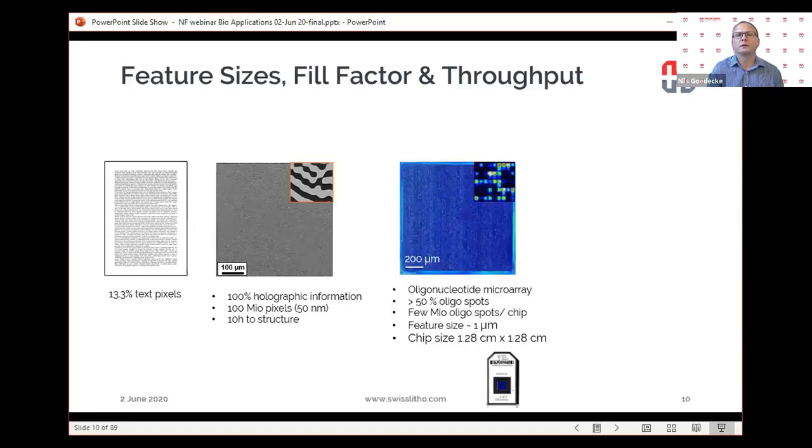For example, if you go to an oligonucleotide microarray or gene chip today, you find that those chips are also highly dense packed, but they are often more spaced apart from each other. Unfortunately, the manufacturers nowadays don't boast too much about their microfabrication anymore.